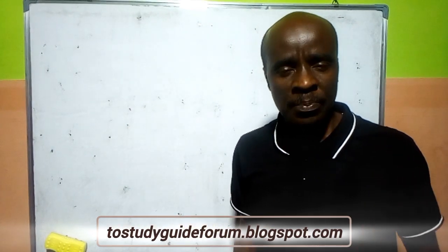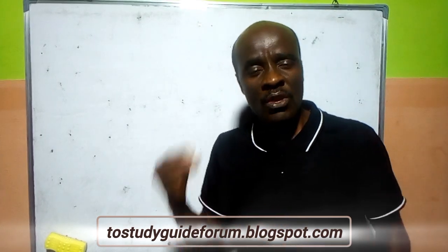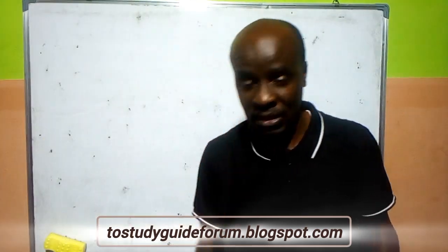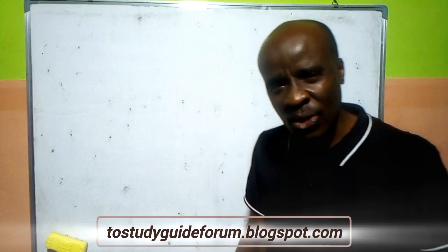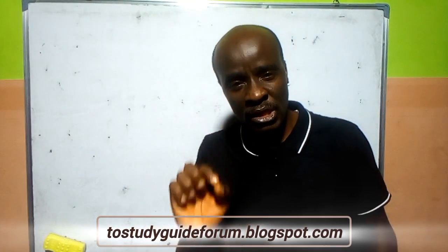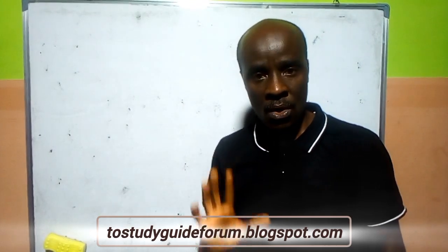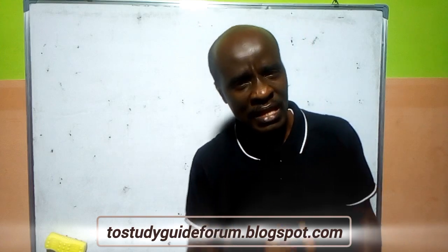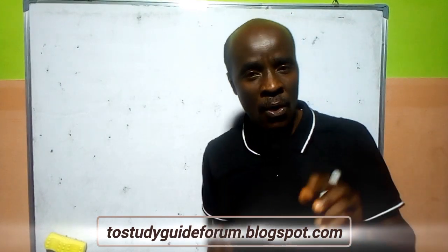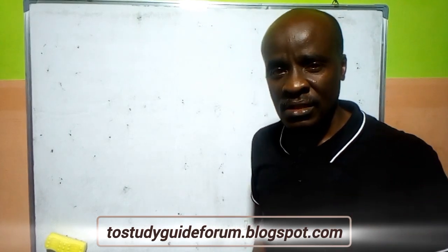So what does it mean? It simply means that since a test is predetermined, you should be able to know. The first thing you should know is that the particular test that confirms each of the ions is very, very important. It's important that you note that very test. For example, chloride ion: one of the predetermined tests for chloride ion is a test with silver nitrate.